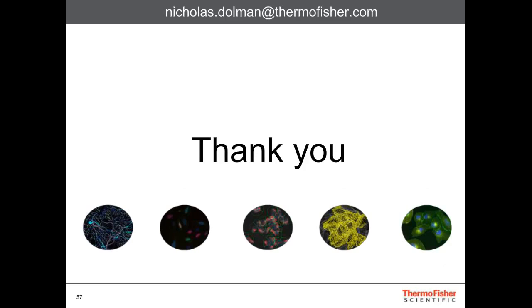And our first question is, how accurate are these techniques using 3D tumor models? Are they tested for spheroids or also for the hydrogel-based model? Can you talk a little bit more about how high-content imaging is being used today to look at organoids and 3D models? For example, what measurement systems or markers are they using?